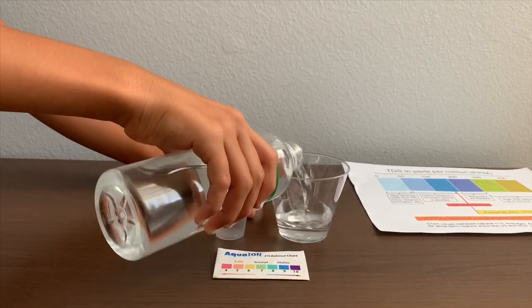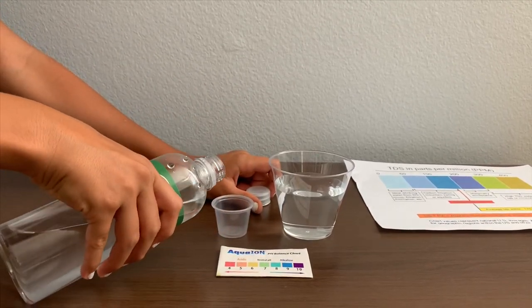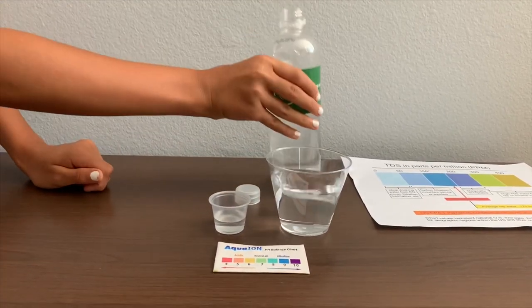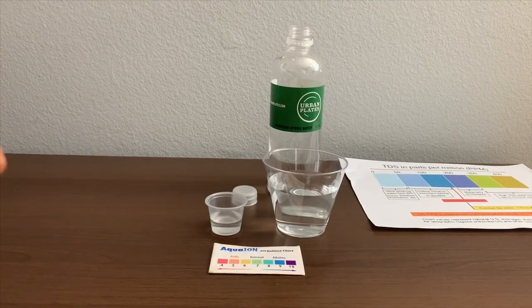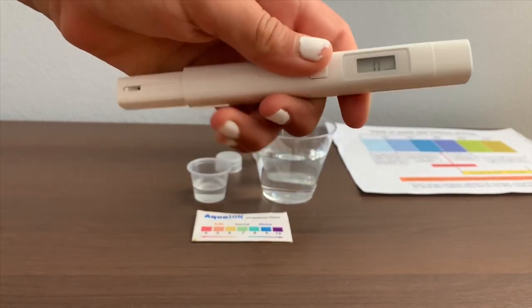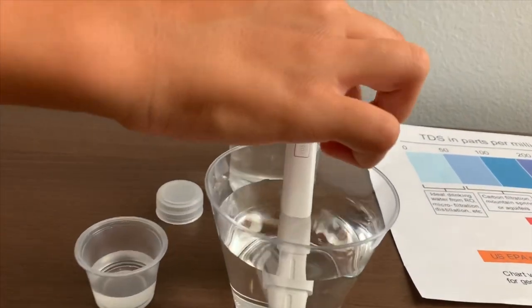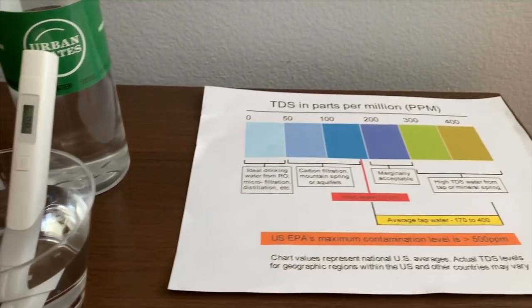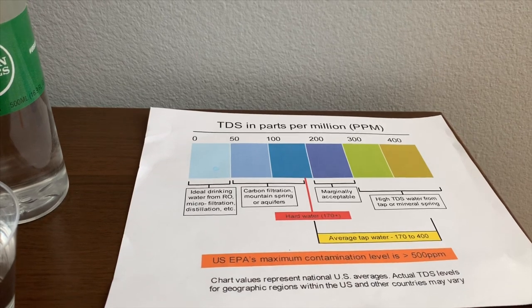Let's pour some water in. First we're going to test the TDS level. If you want to buy this TDS tester, check the link down below. Turn on the TDS tester and make sure it says 0. Put it in. 94 — that's this Palomar Mountain spring water.